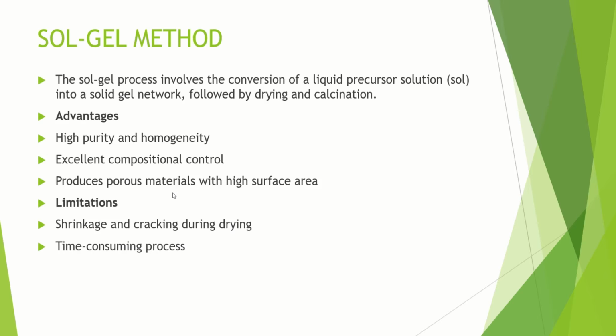It is also great for making porous materials with very high surface area, which is perfect for a catalyst. But it's time consuming, and during the drying process, the gel can shrink and crack. That's something you have to watch out for.